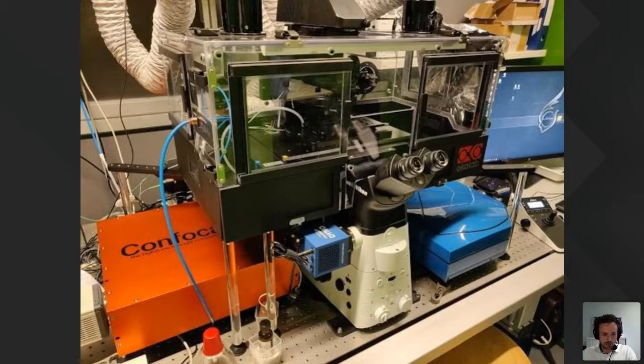And here they have a Nikon TI2 with, on the right-hand side, a 3D adaptive optics module from Mikeao. And what they do is they make 3D STORM images, and they correlate them with the confocal data on the left side. So there's a very nice and complex system.